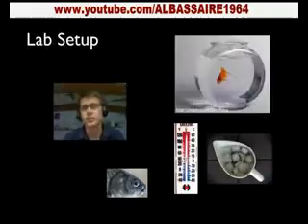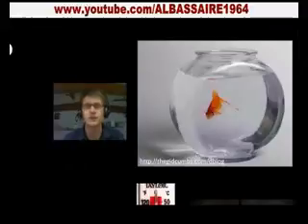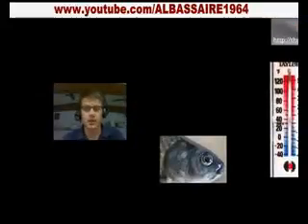The second part, we actually study goldfish. In this, we put a goldfish in a tank. We try to eliminate all the extraneous stress and movement around them. And then we measure their respiration rate by counting their operculum movements per minute. Now the operculum, remember, is the gill covering.